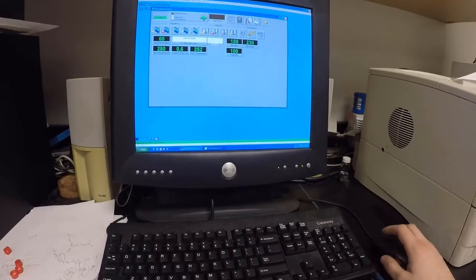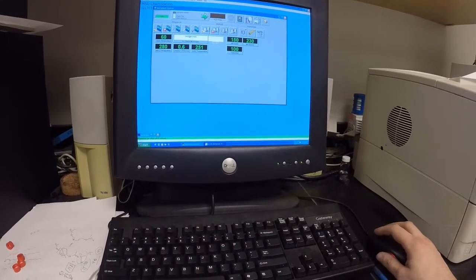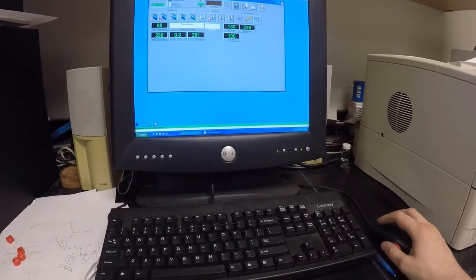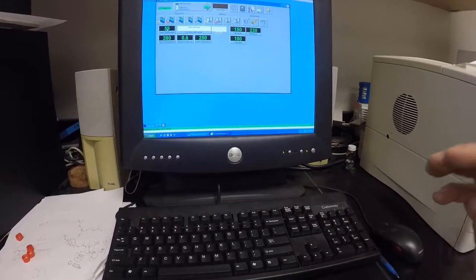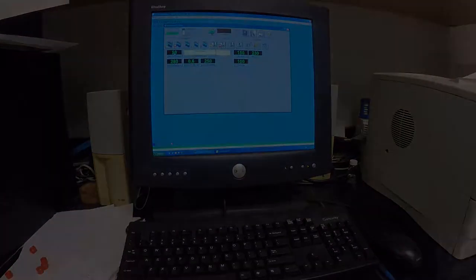Now what we're going to do is wait for it to say oven ready. We need to get the oven to the right temperature. Right now it's at 60 and going down. As soon as that's ready, I'll send you back.